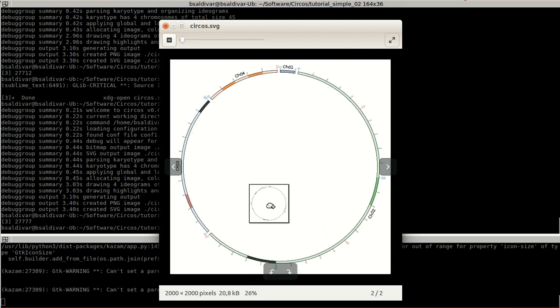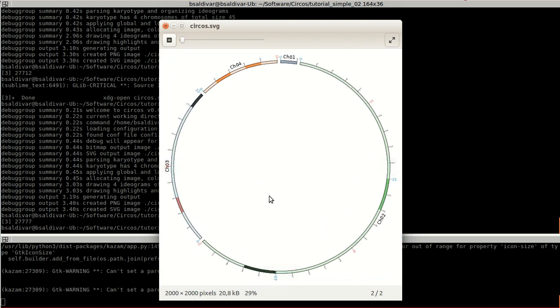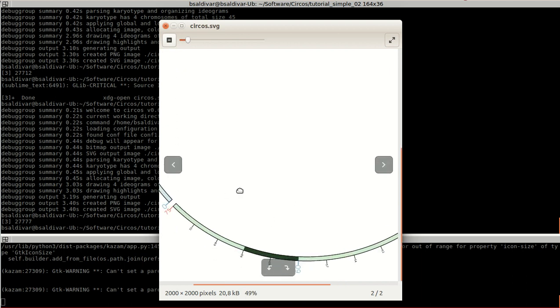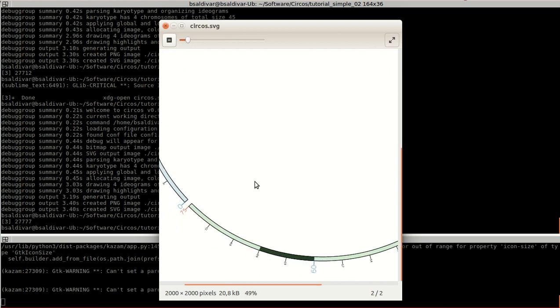And actually, you can see that over in the part from the bottom, it appears 60 in blue. That's it for this part of the tutorial. That's it.